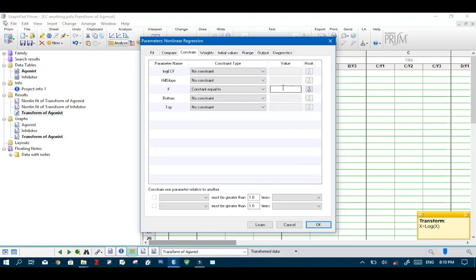Now in this dialog box we need to enter the F constant value. To find EC 90 our F value has to be 90. When we are looking for EC 10 our F value is 10. When looking for EC 70 our F value is 70.